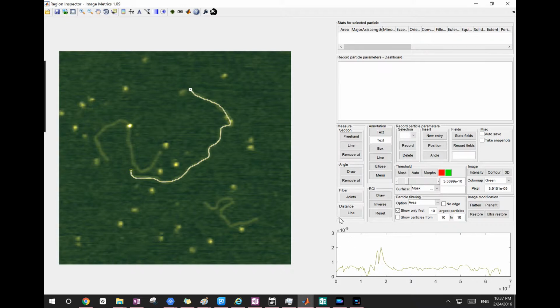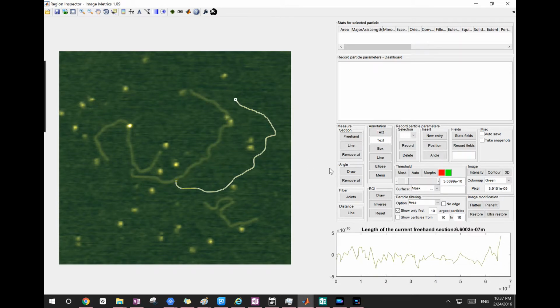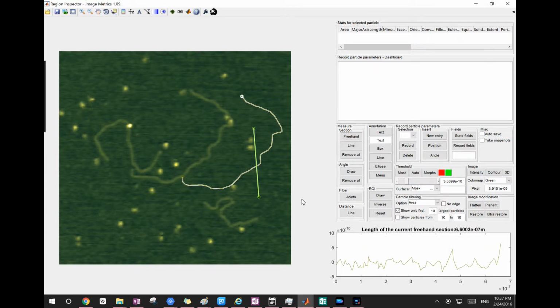I discussed those differences in the text of the instruction. So this gives you a profile, and you can actually move these. You can also do a line section measurement like that. You can, of course, draw multiple lines or freehand lines. These all give you the profile section. If you want to overlay these profiles, you can say add to section overview. Just right-click this.